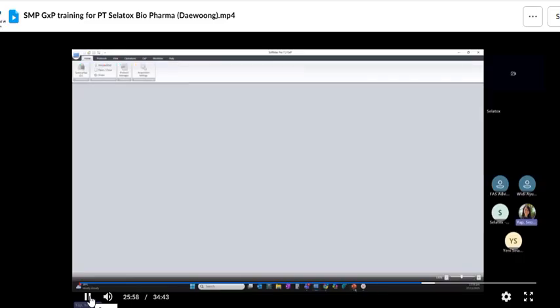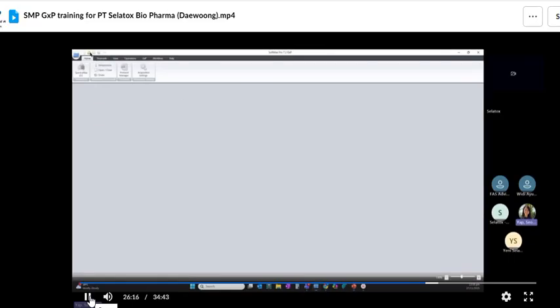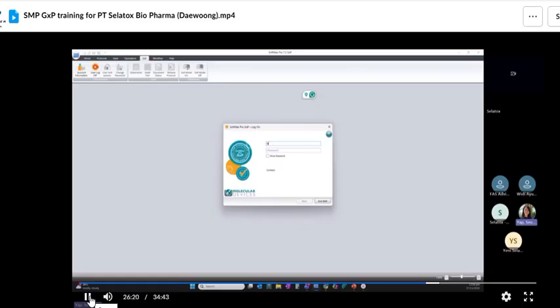All right, so now you another person, lab technician, when you log in, right, you can see the project A protocol file. Okay, and when you run it, you don't have to save the file because it's auto save to the name and the location. Remember, the site is created. I will show you. Okay, so now first thing, you log in as the lab technician role, which is the lab assistant. The name is the lab assistant.